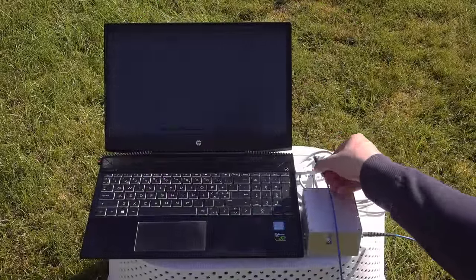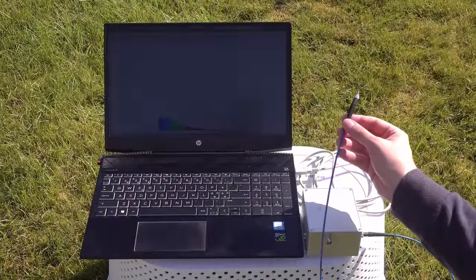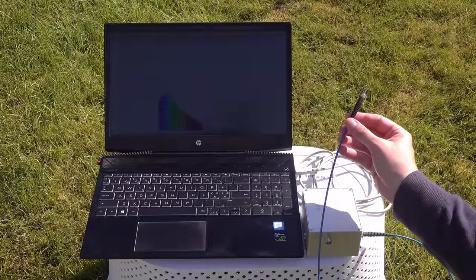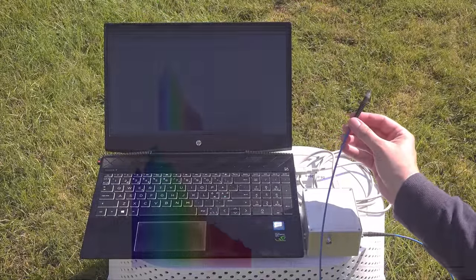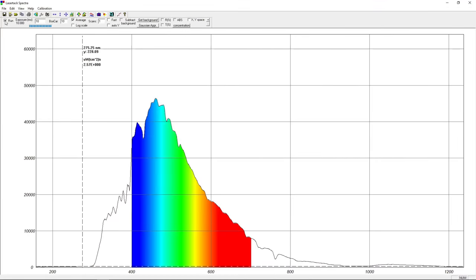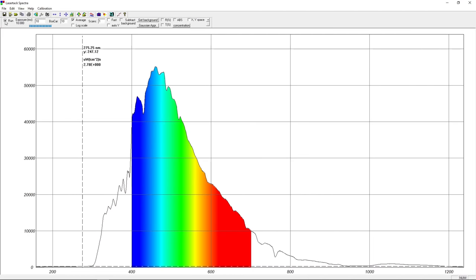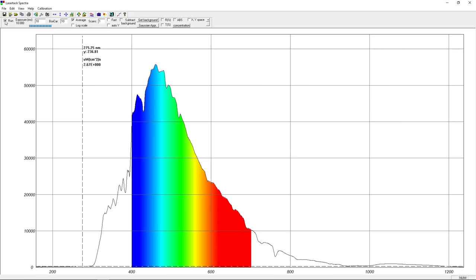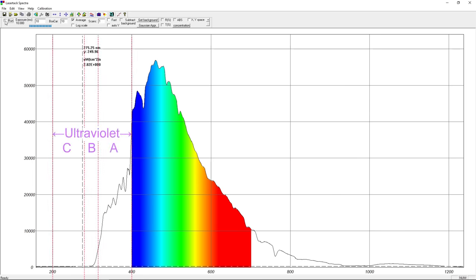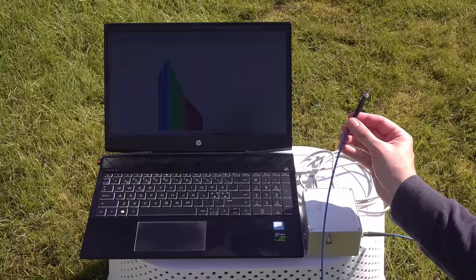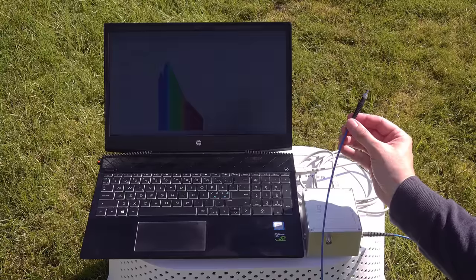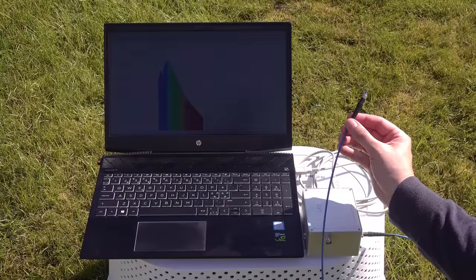Alright, time to see how much UVC sunlight contains. This is the spectrum from the blue sky near the sun. I am not pointing directly at the sun, it would overexpose my spectrometer. As we can tell, there's practically no UVC in sunlight. That's why I try to avoid UVC exposure altogether. It just isn't something we are used to dealing with or naturally encounter.